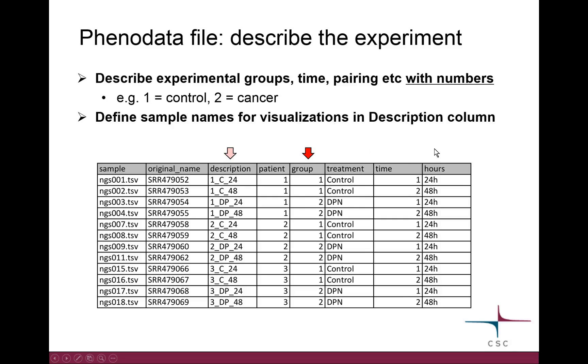Depending on your experiment, you create the columns that you need. The most important thing is to use numbers here. Then I want to point out this other column which also has a special meaning: the description column. This column, which is titled description, is what is used for the plots. When you make images for publication, for example, you probably don't want to have just file names there for the samples, but you want to name them some other way. So what you write there will appear in your images that you create in Chipster.